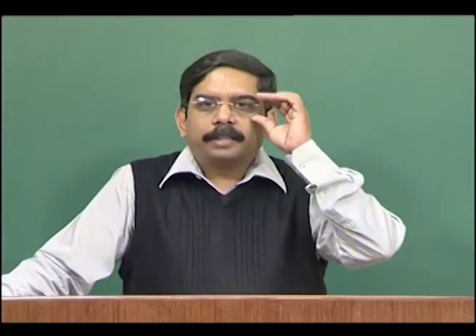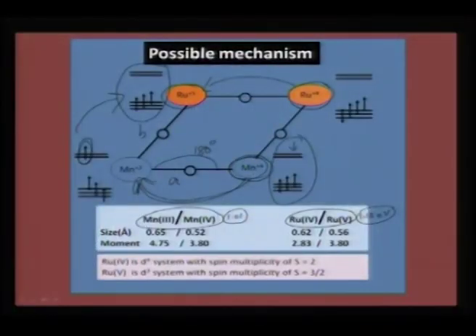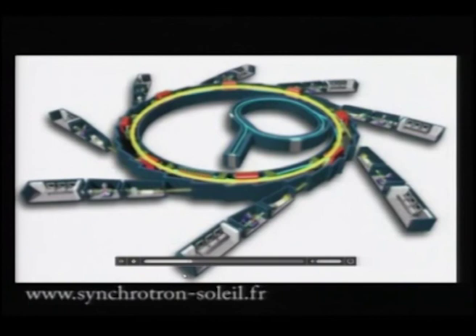So this is one case that I have tried to explain to you, where X-ray can without any doubt resolve this issue, because it gives you precise information about the local structure and the oxidation state. As a result, we can propose a mechanism which is very unique to this particular compound. So with this I would like to finish, and there is a small animation that we can look at, showing how the instrumentation is housed and what facilities we can see.